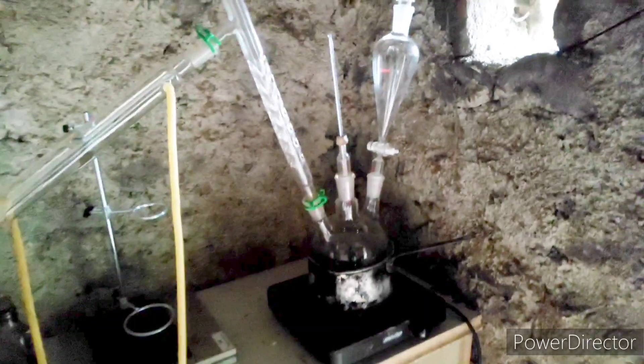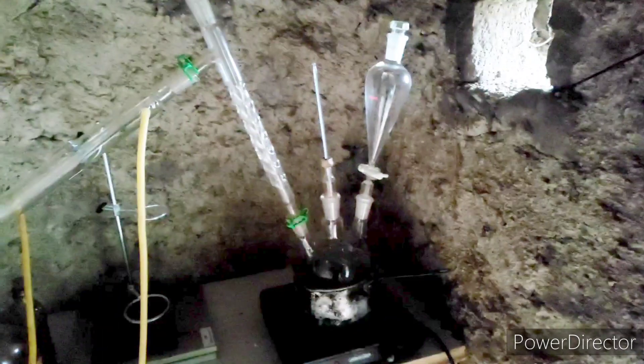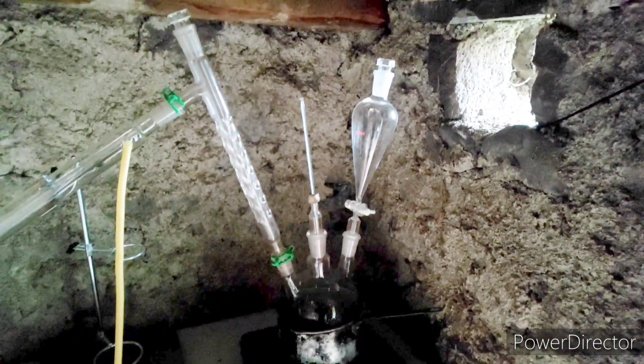Here you can observe I changed the setup a little bit, because I just found a thermometer, so we need a three-neck round bottom flask.